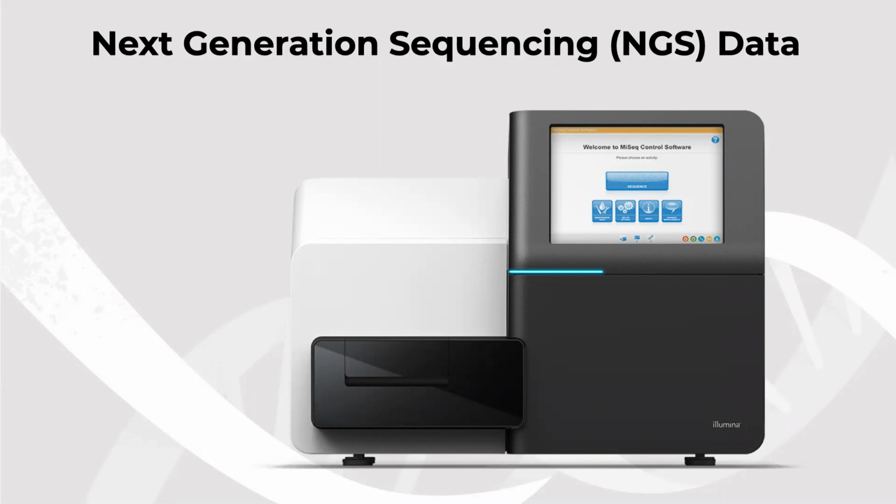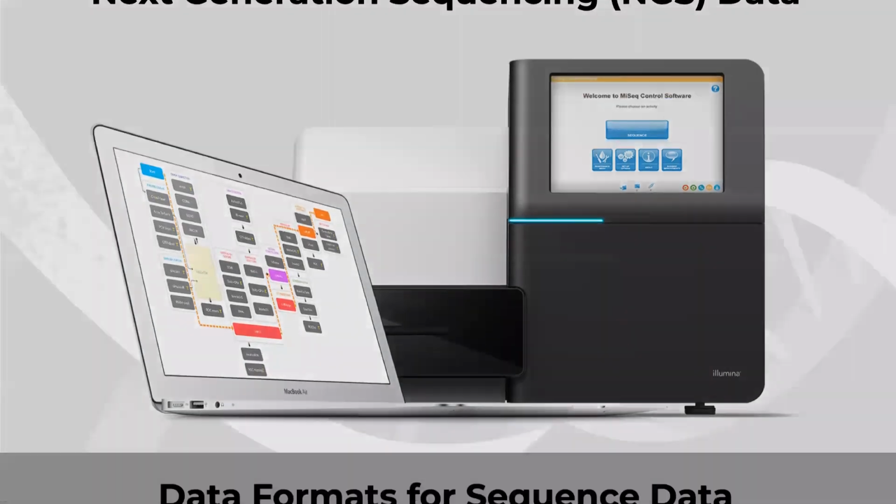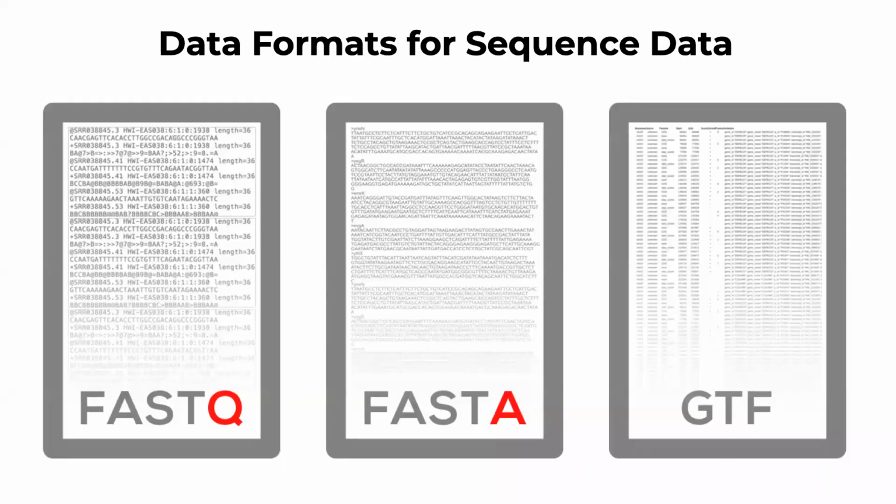One of the biggest challenges with this kind of sequencing is the need for processing. And so let's talk a little bit about how specific steps in preparation for mapping and after mapping can help us understand what is really going on in the transcriptome. So as you remember, there are a number of different types of data formats that we have to remember as we speak about RNA-seq.